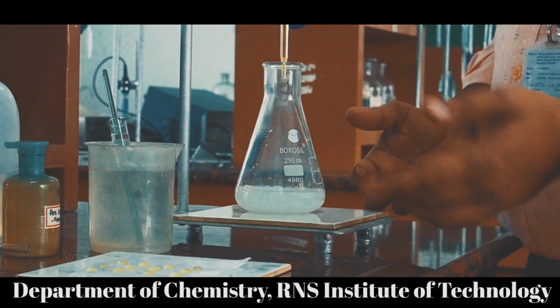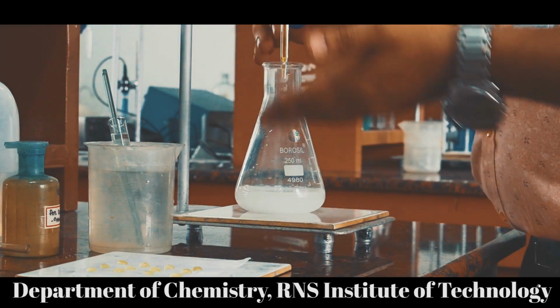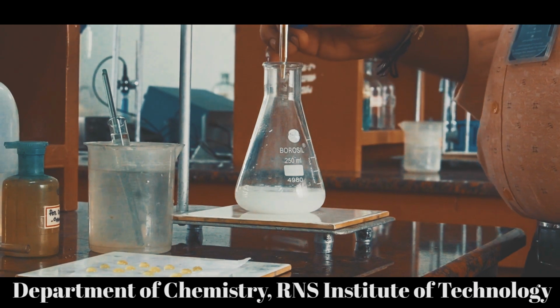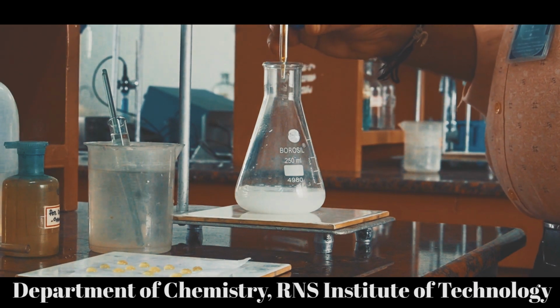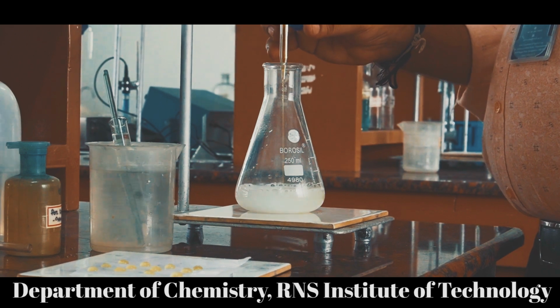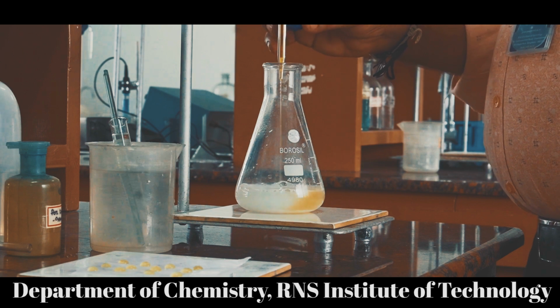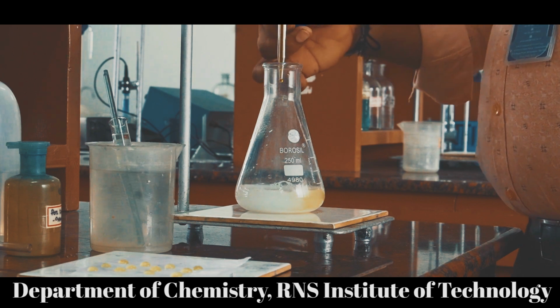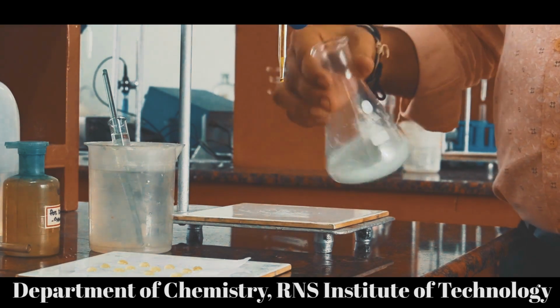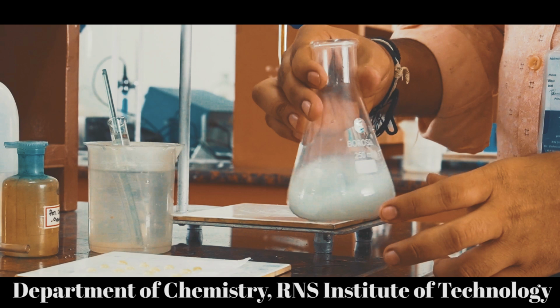We will not be knowing because the indicator is not there. So that's why first let us make a plan. I will add up to 7 ml first. This can be K2Cr2O7 in solution, right? So if you are adding 7 ml, just take the solution. Start this addition and check whether we have reached the end point or not.